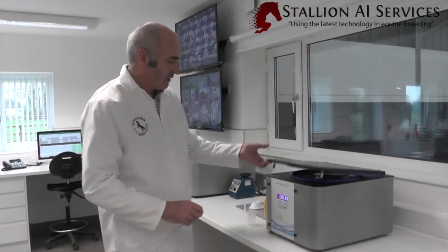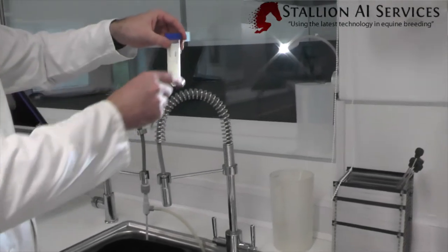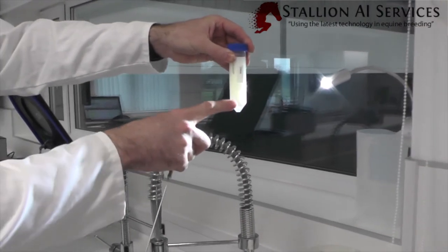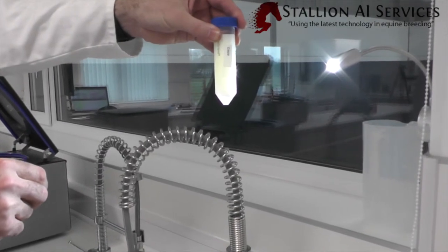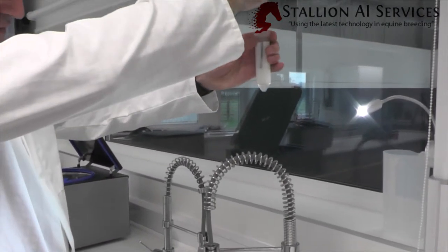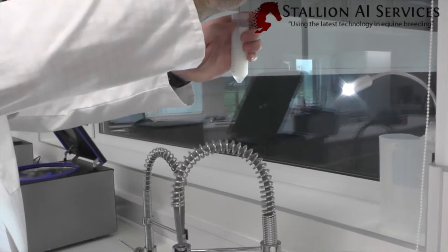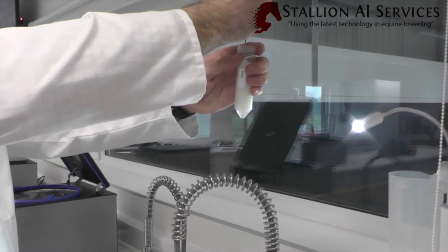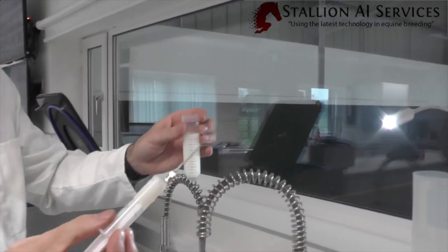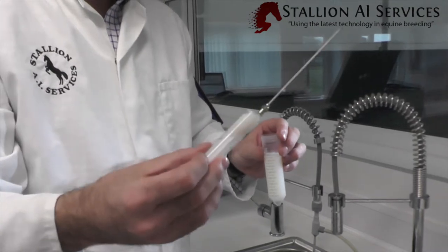Now the centrifuge is finished. We take it out, and if we look underneath we can actually see the cell band right at the bottom — this dark shadow sitting on top of the cushion. We take the lid off, go down with our needle, and take off the cell band which is the semen sitting just on top of the cushion. And there we have very dense semen, which we can then re-suspend in extender or freezing extender, whichever way it needs to go.